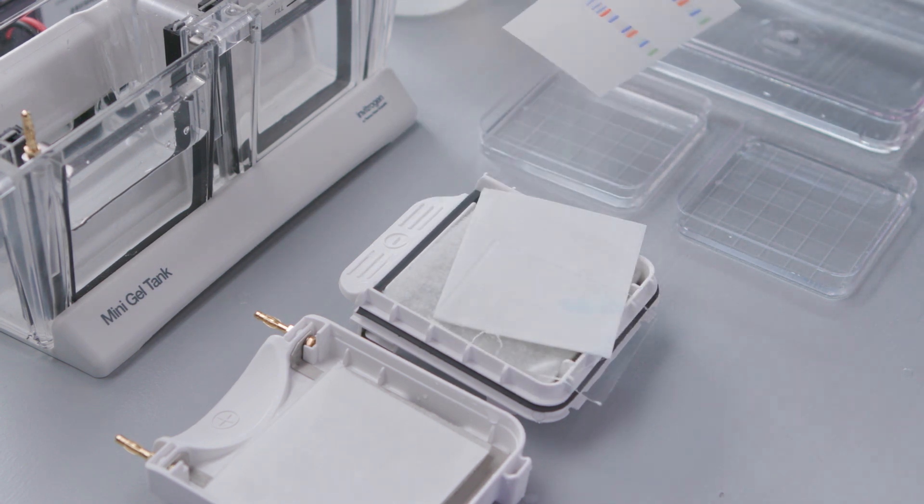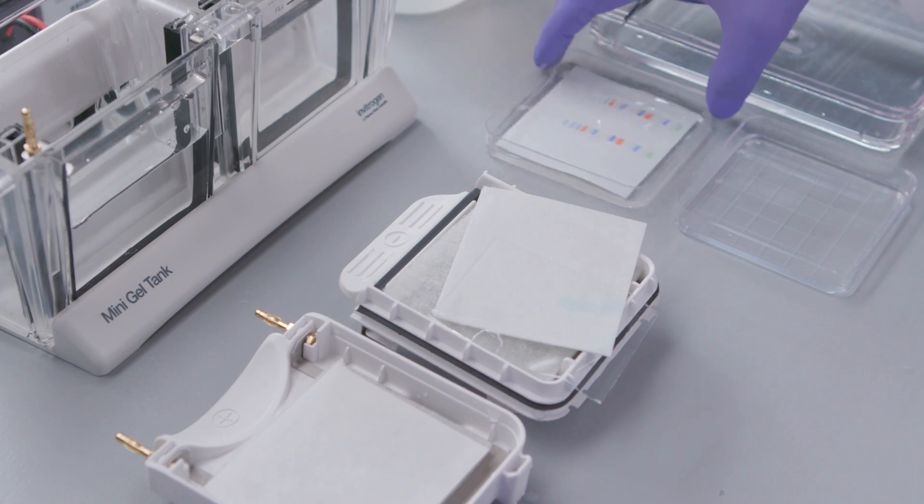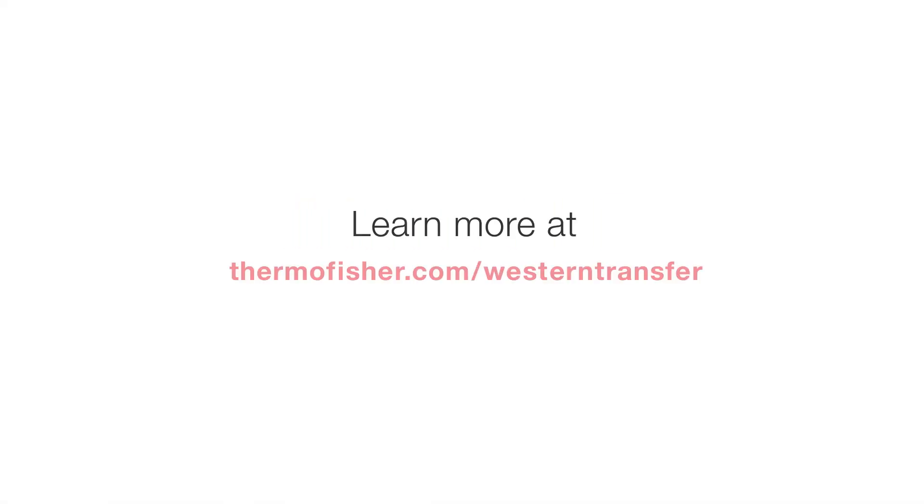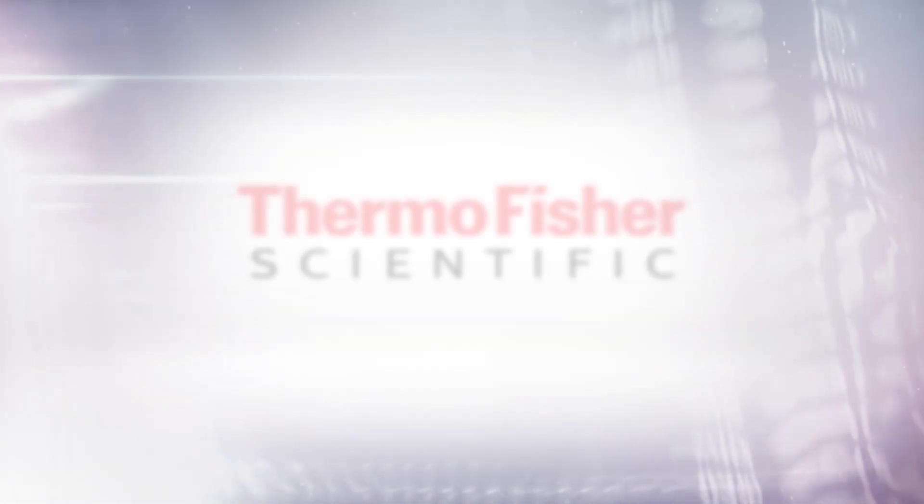You are now ready to probe your membrane for western analysis. Find out more information about western blotting with the mini blot module at thermofisher.com slash western transfer.